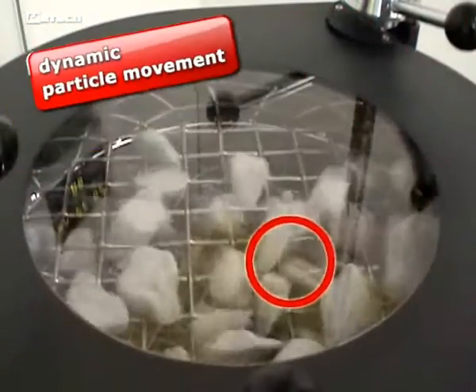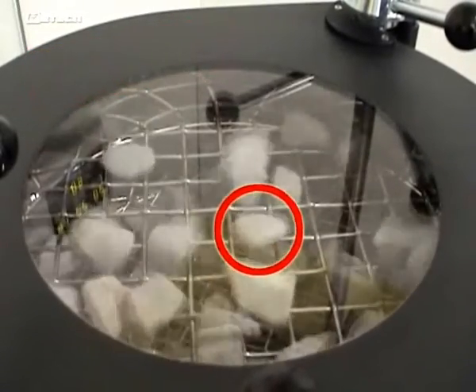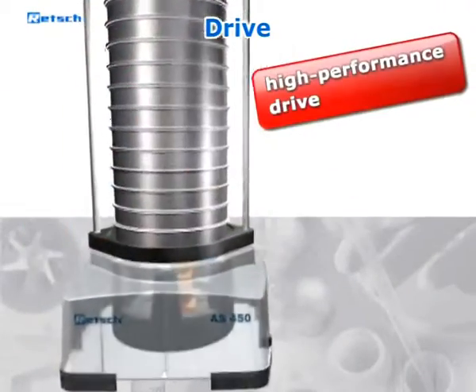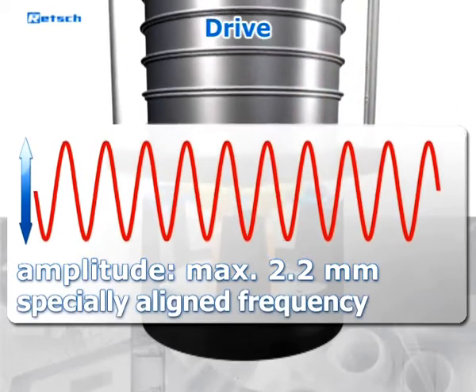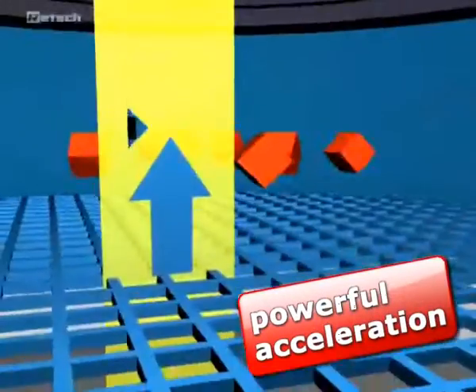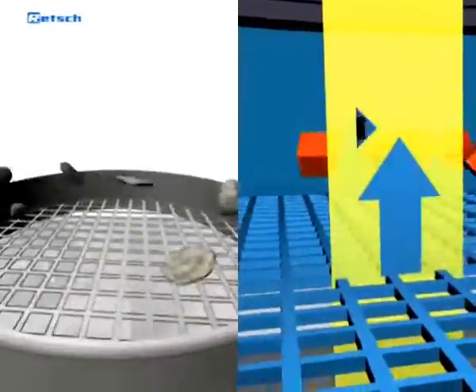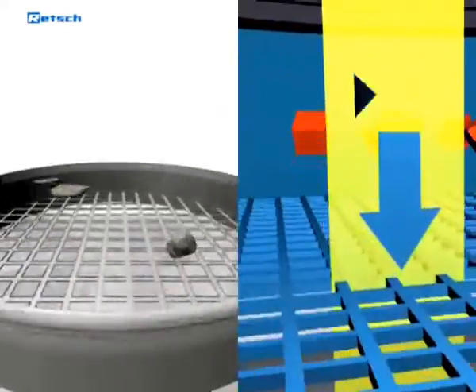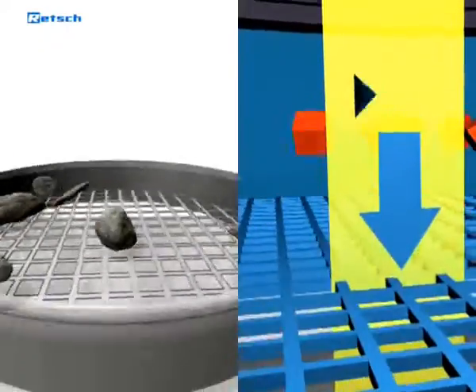The unique drive performance ensures that even heavyweight chunks are moved dynamically over the entire sieving surface. The required power is provided by the high-performance drive, which works with a maximum amplitude of 2.2 mm and a specially aligned stabilized frequency which, in addition, ensures worldwide reproducible results. The interaction of both amplitude and frequency results in a powerful acceleration which is transferred directly to the particles on the sieve mesh. The particles are thrown upwards in a three-dimensional motion and hit the sieve mesh each time in a different position, causing a very high separation efficiency and therefore excellent and precise results.